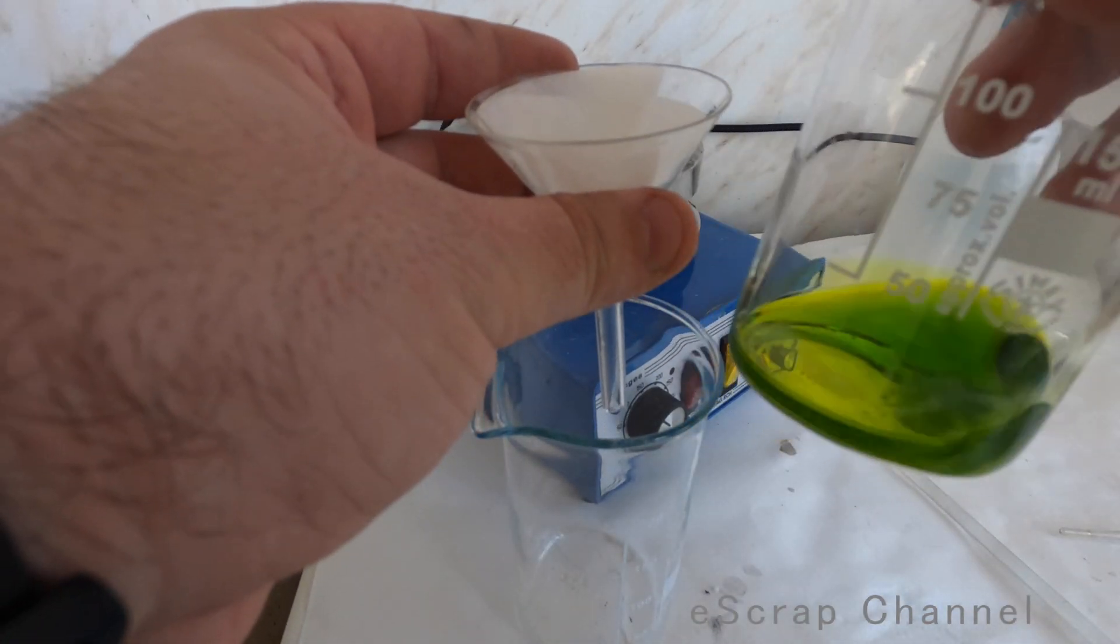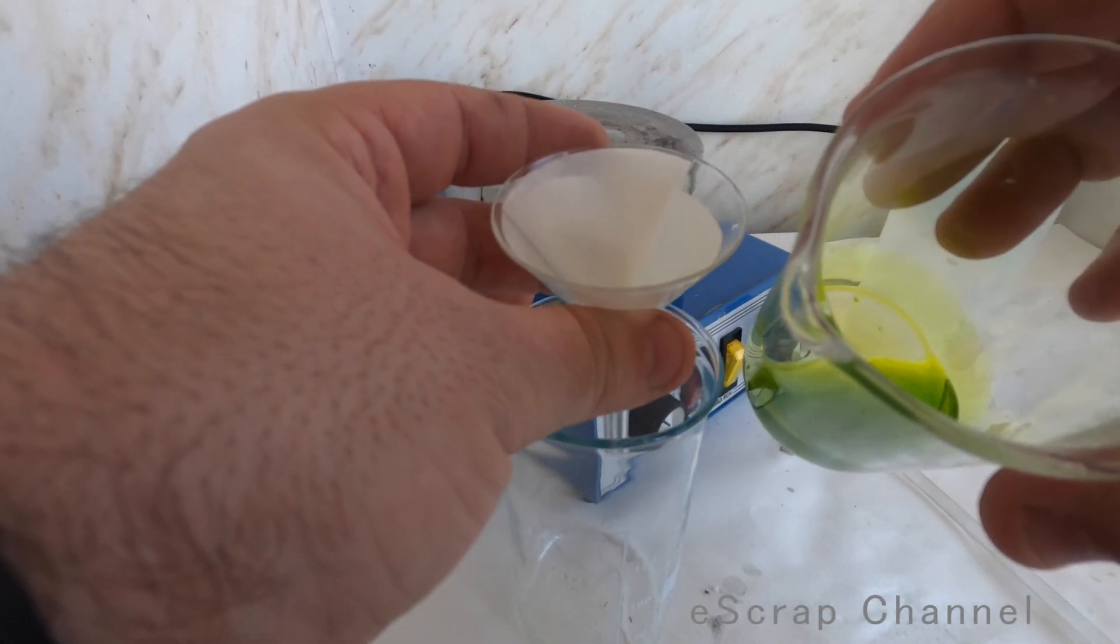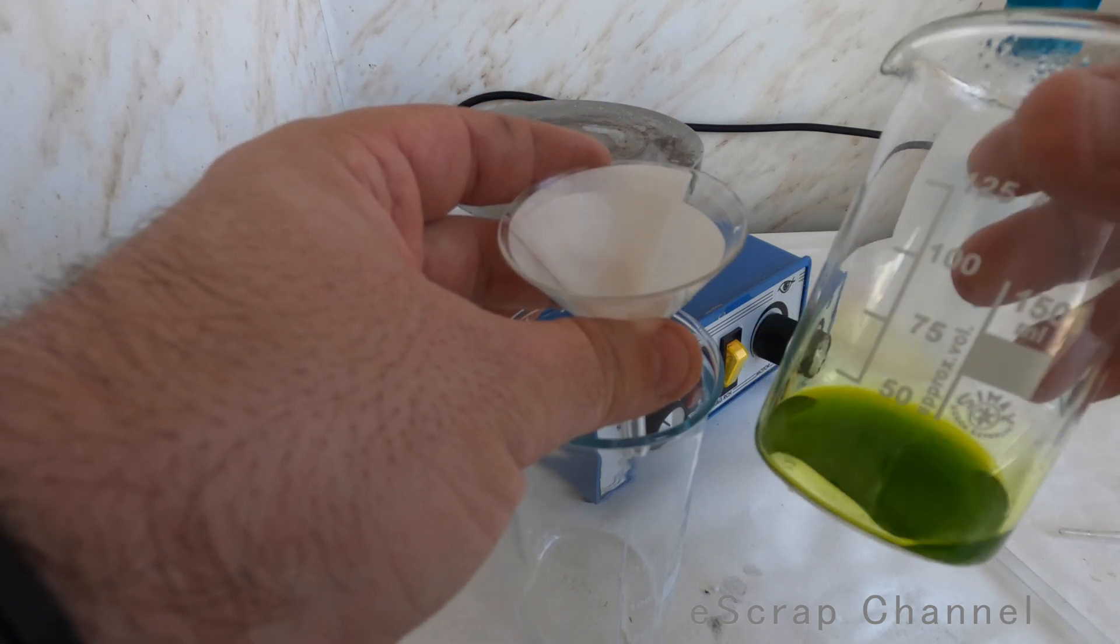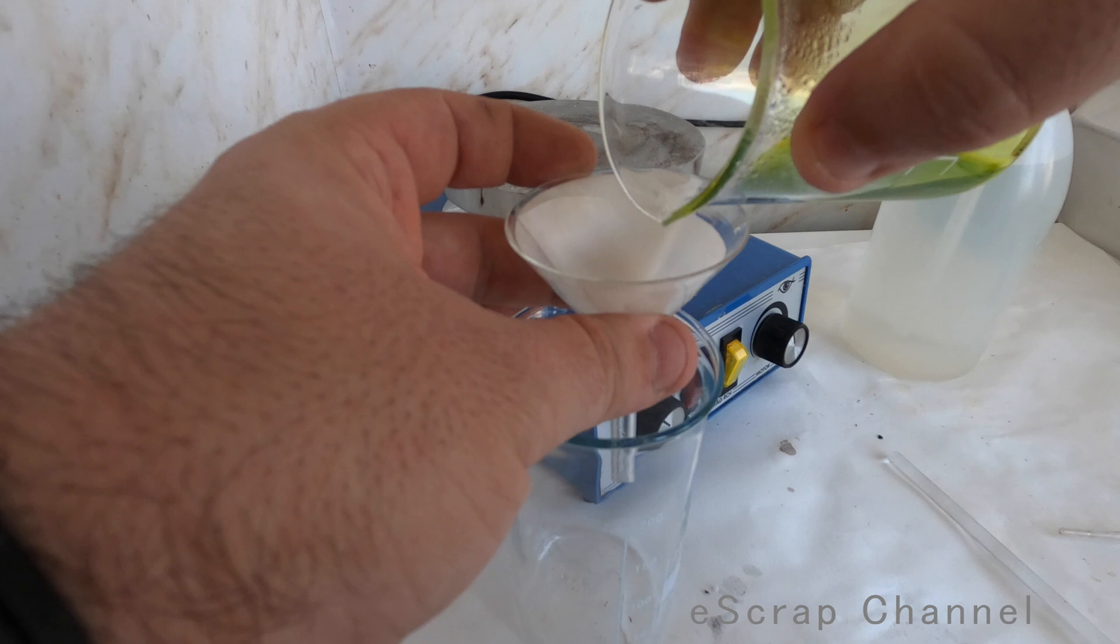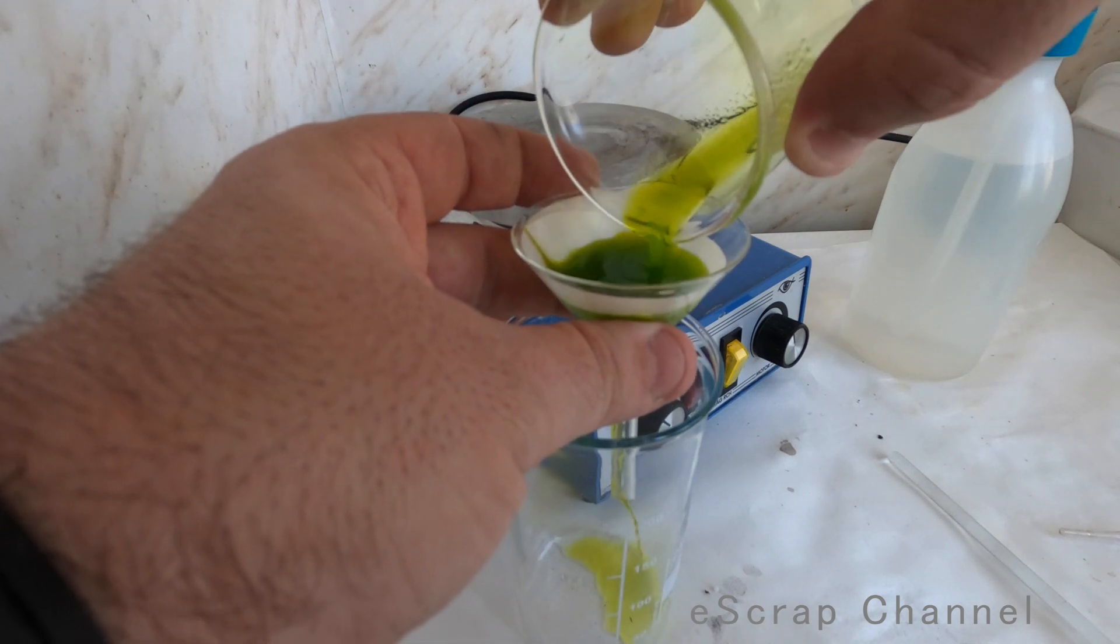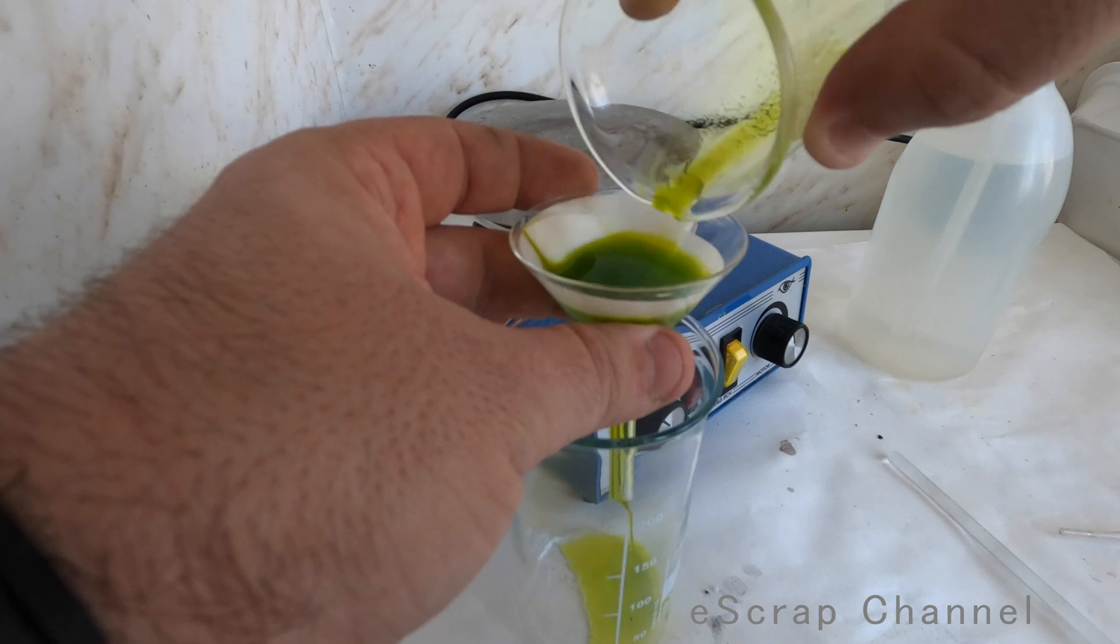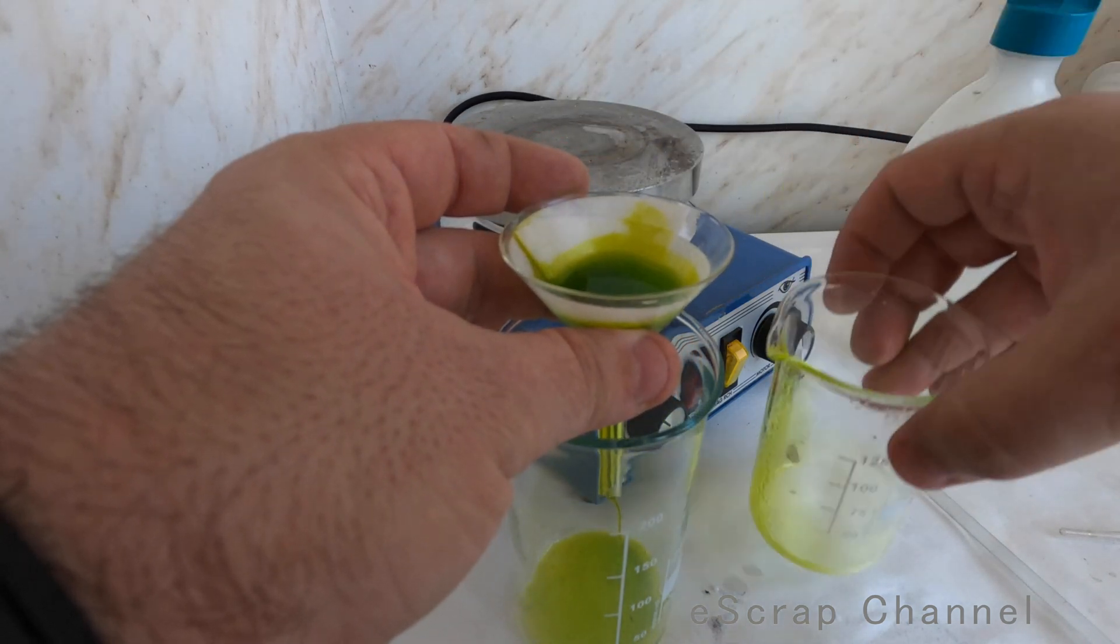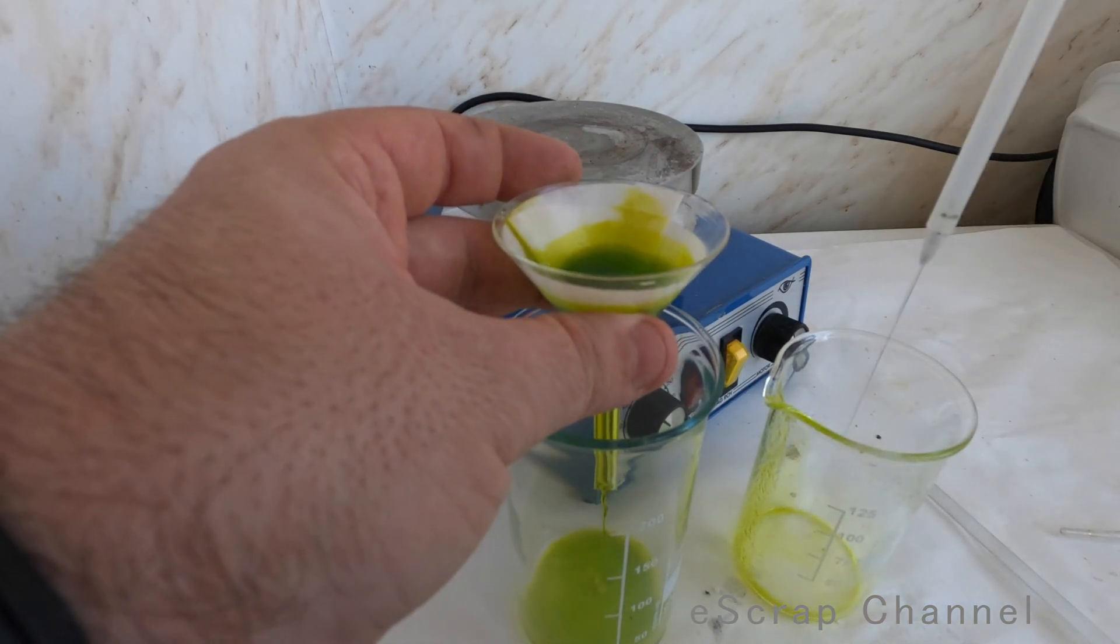Okay guys, so this is our final solution. We have some white material inside. This is probably silver. So I will filter out the gold. It will really quickly filter. As you can see.